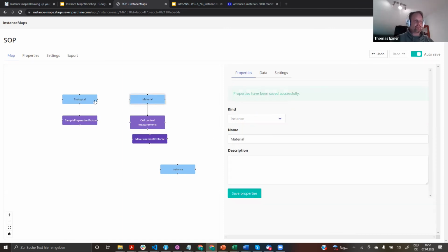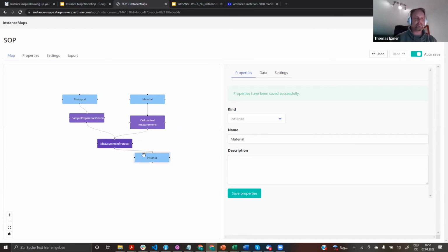And then you do something with the one, then you do something with the other, and then you put them together and do something with the whole system. And then after that, you have to be careful that the cross is moving. And then you do this. Therefore, this is relatively often, or at least I had the problem that I needed this from time to time, this combination of multiple things coming together.